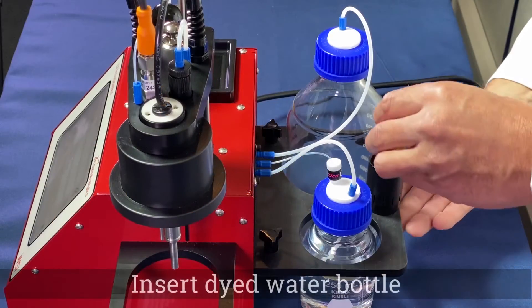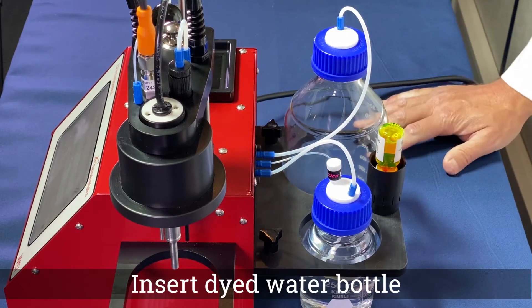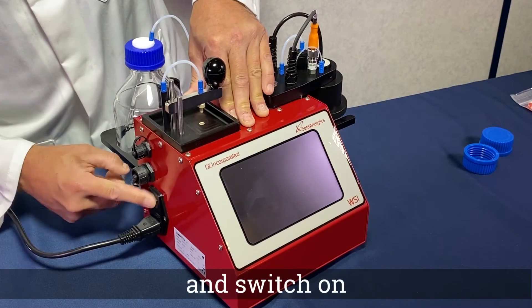Turn the dyed water bottle upside down and firmly press the bottle onto the needle of the water bottle holder. Connect the mains power cable and switch on.